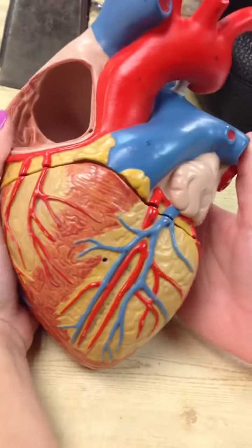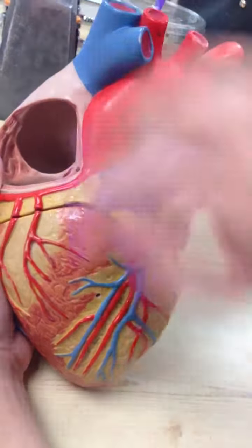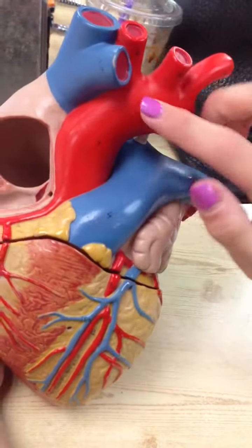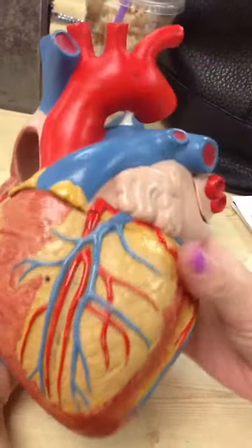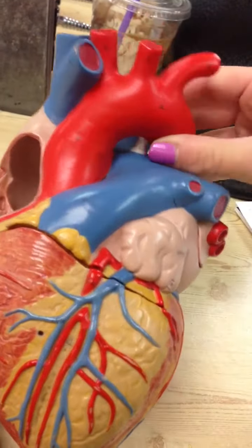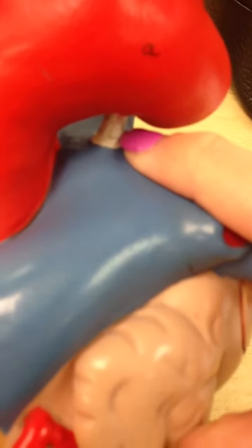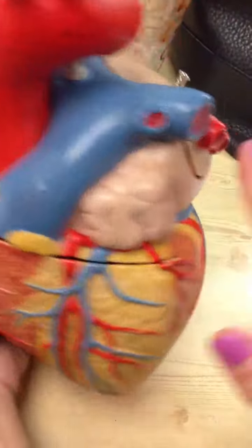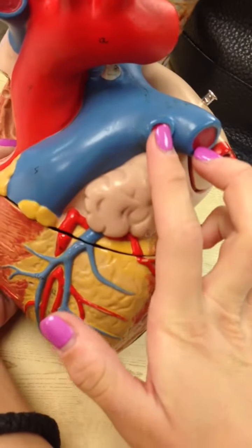The anterior portion of the heart. At the top is the base, the bottom is the apex. At the top you have the aorta. Right here is your pulmonary trunk. What connects the two is called the ligamentum arteriosum, which is the white connector. On the pulmonary trunk, you have right here your pulmonary arteries.